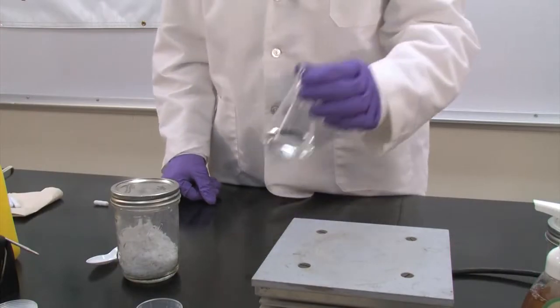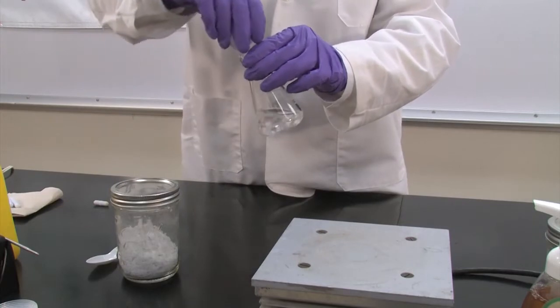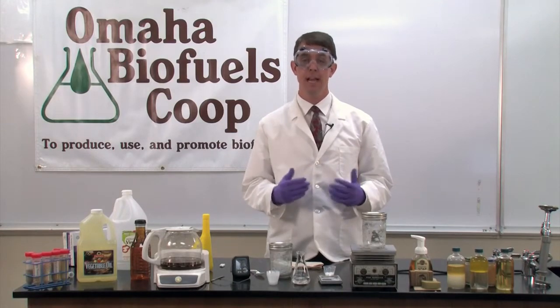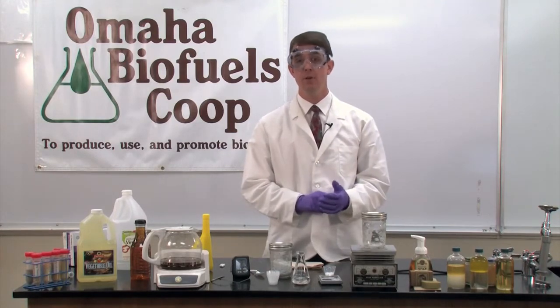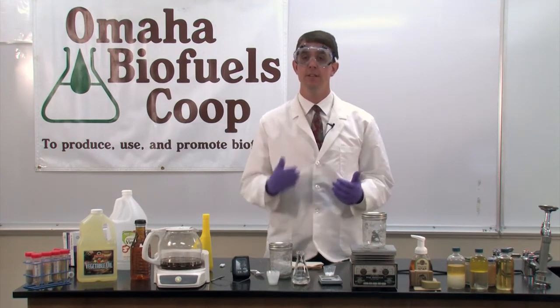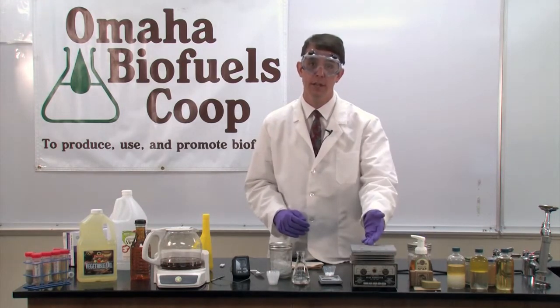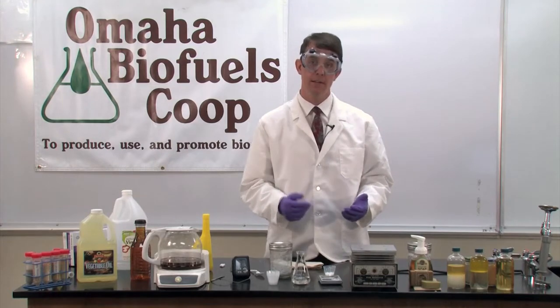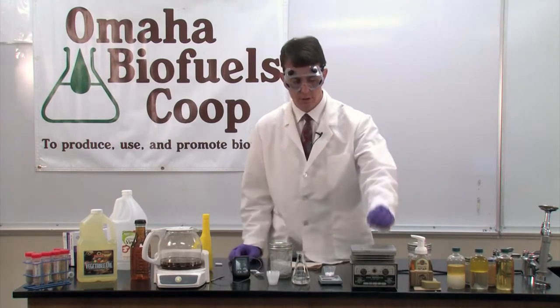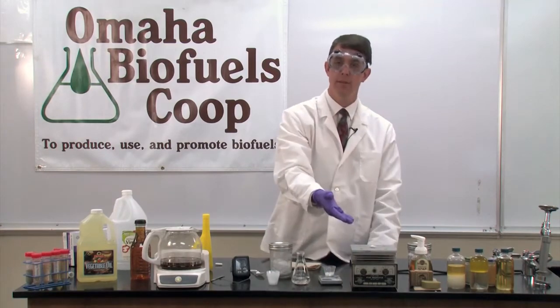Next, we'll dissolve the catalyst into the methanol, making a methoxide solution. The dissolution reaction is exothermic, meaning it produces and gives off heat. At a larger scale, it can even produce dangerously high levels of heat, getting to above the point of boiling for methanol, which is 148 degrees Fahrenheit, significantly lower than the boiling point of water. We're going to use a magnetic stir plate to help provide mixing. In the base is a motor attached to a magnet. The magnet can magnetically couple to a magnetic stir bar, and when the motor rotates, the stir bar rotates, providing mixing.